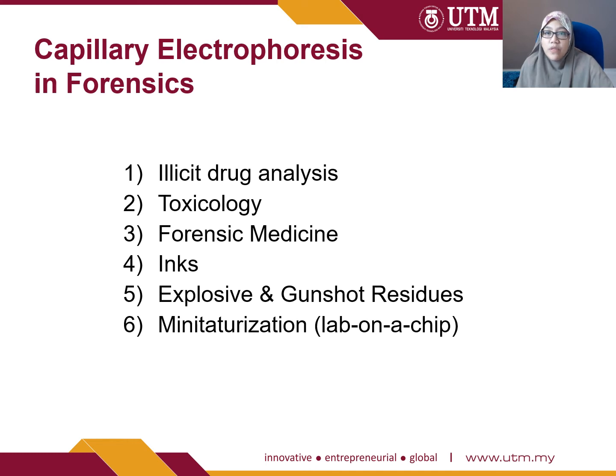So with CE, we can check each of the inks to see whether there is alteration in the inks, in the writings of the document, and we can also check for ink source comparison. Most of the time people use GC and HPLC, but sometimes if the difference is too small, we can also use CE to check, especially to check for the aging of various ink samples.